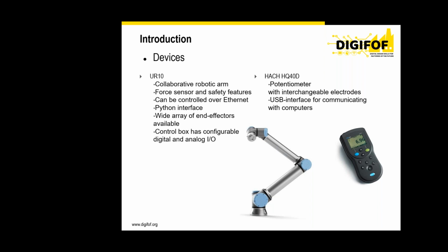Earlier, it was very heavily classified that when a robotic arm was functioning, and if any humans were approaching the robot, it would stop its work. And that was for safety reasons.